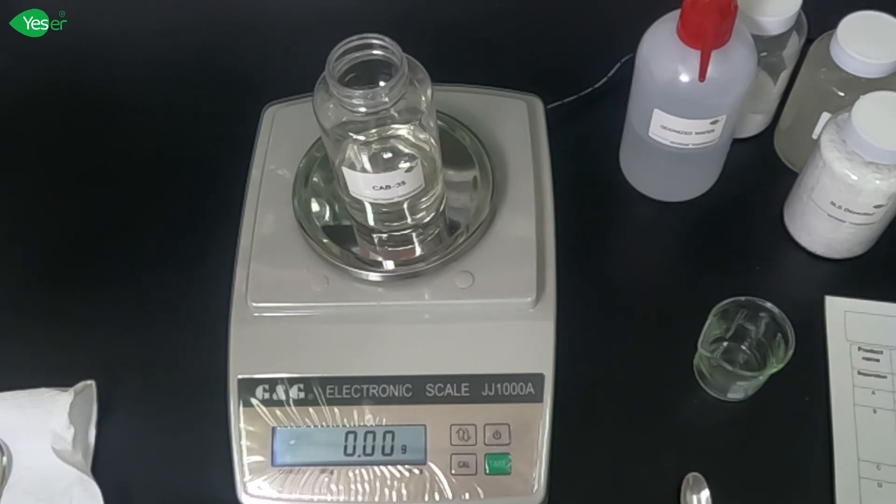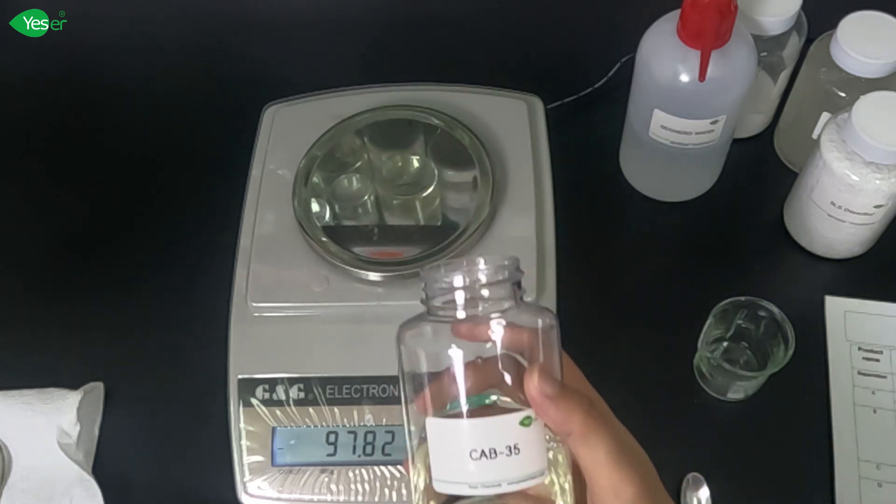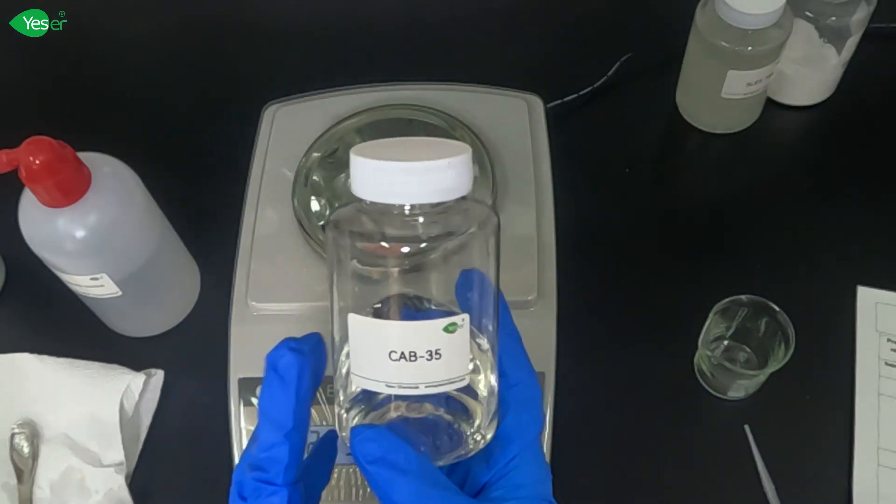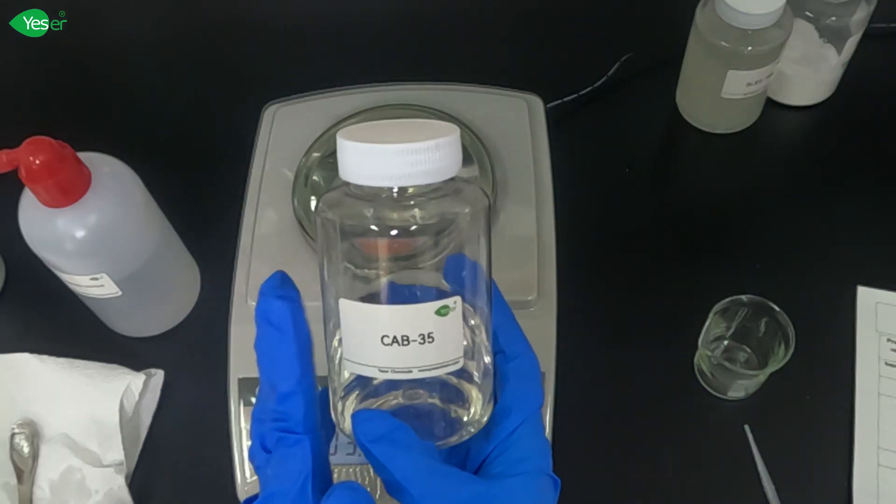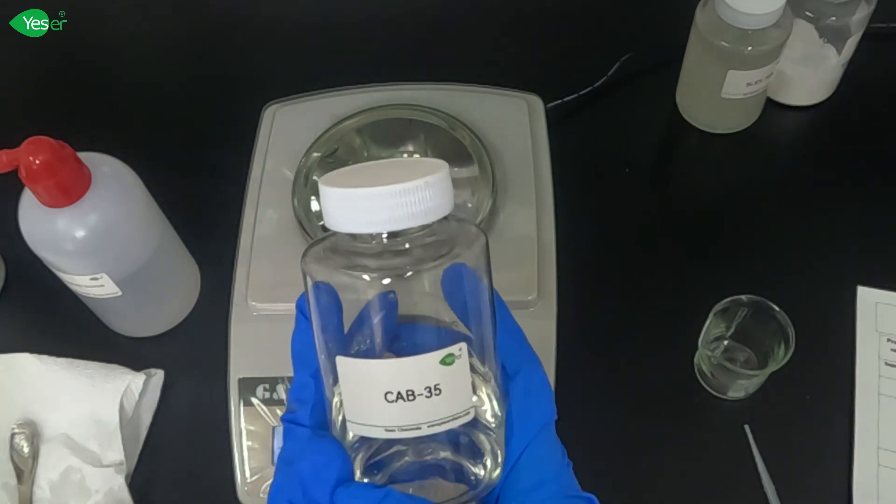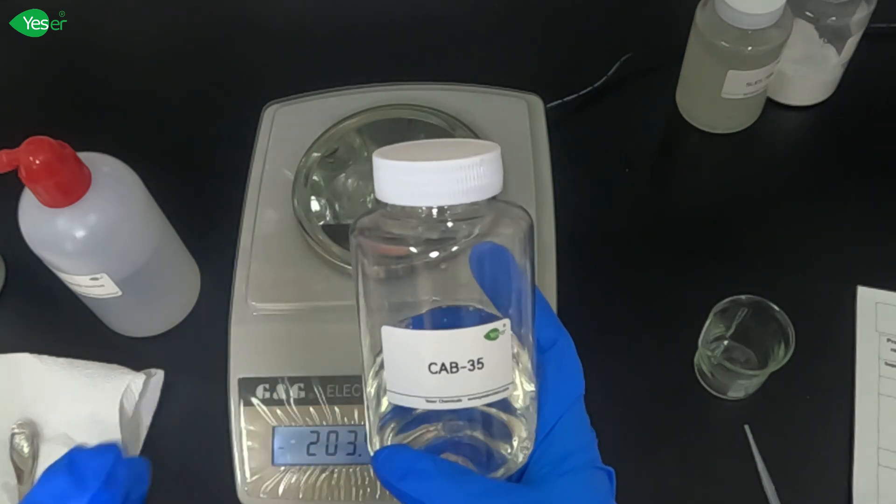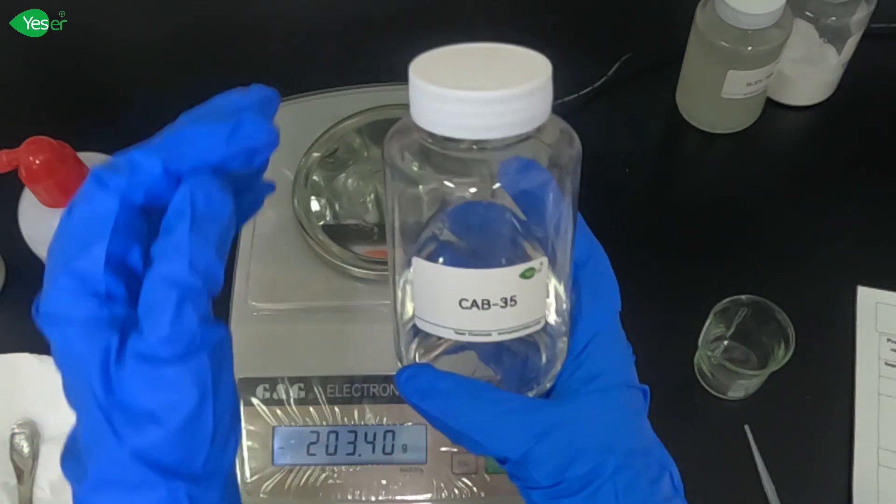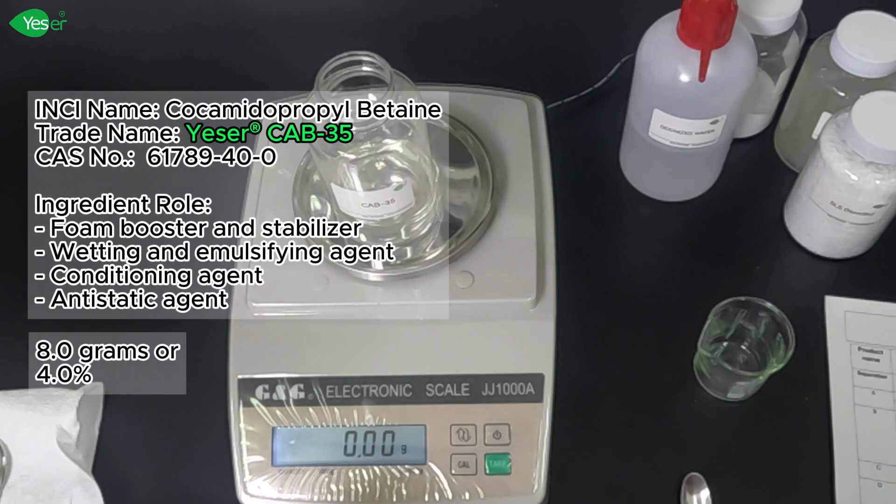After our SLS needle has been completely dissolved, we will now add our CAB 35%. This is an amphoteric surfactant that works to stabilize the foam and helps to condition the skin, making the body wash less irritating and more hydrating. We'll weigh about 8 grams of this, 4% for the formula.